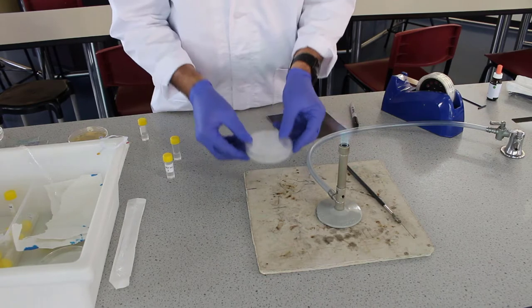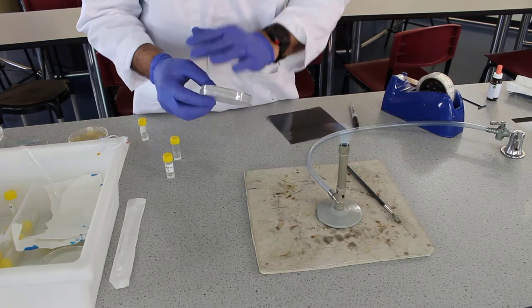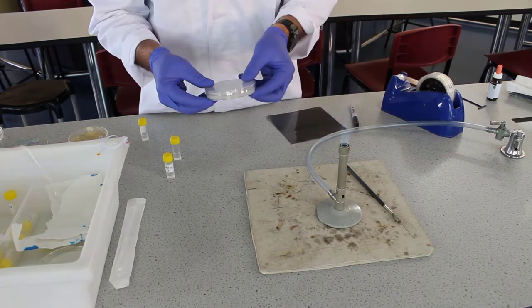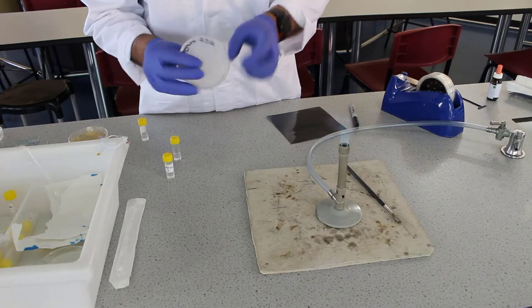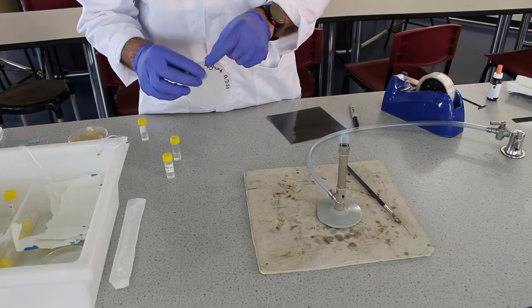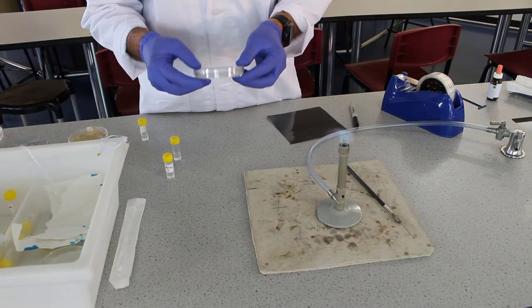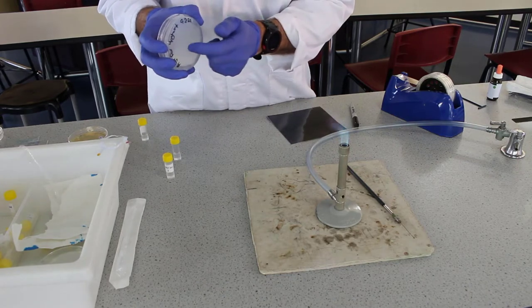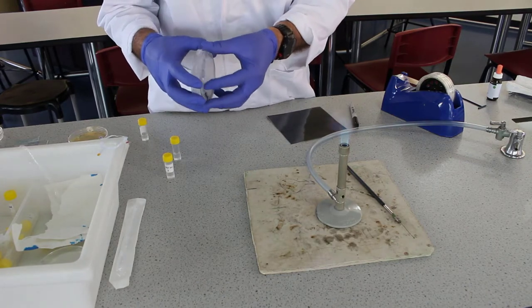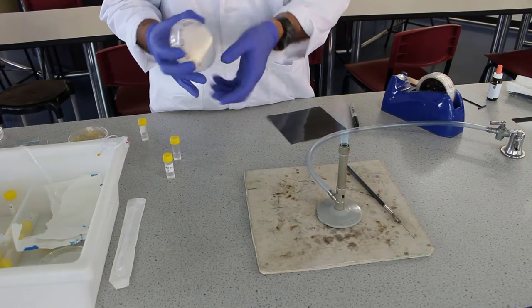The first thing we need is a nutrient agar plate, and on this plate we're going to label the date, the type of bacteria, and the student's name. That needs to be on the base of the agar plate, on the part where the agar is.